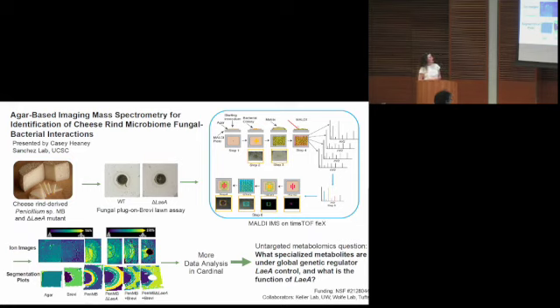From doing some data analysis in Cardinal, which is a really cool R package for doing IMS, I created some segmentation plots which show spatially distinct, or statistically significant spatially distinct, regions.